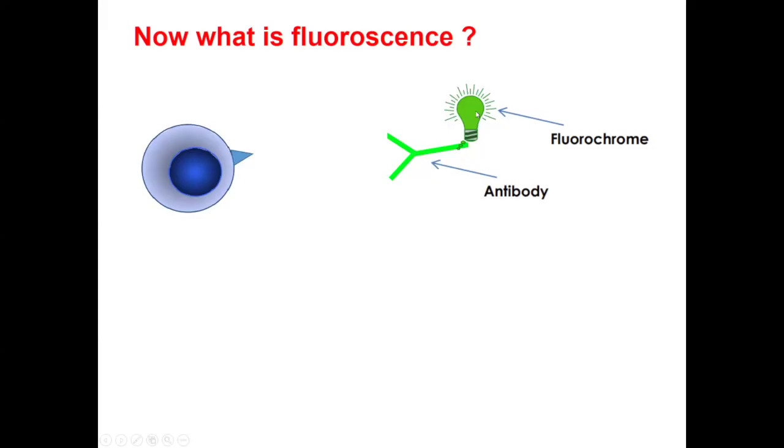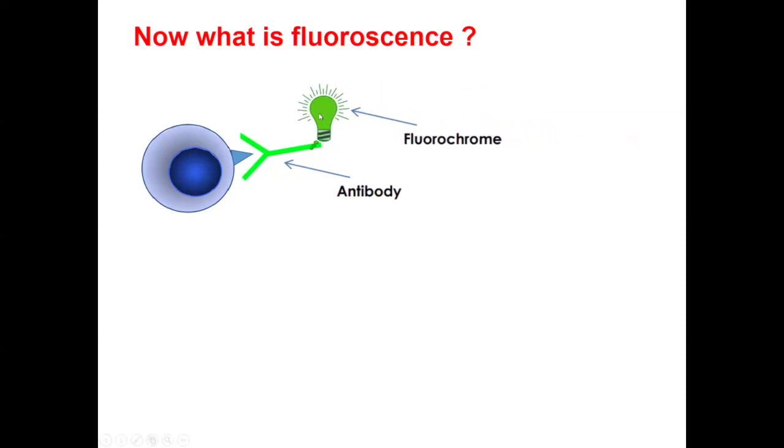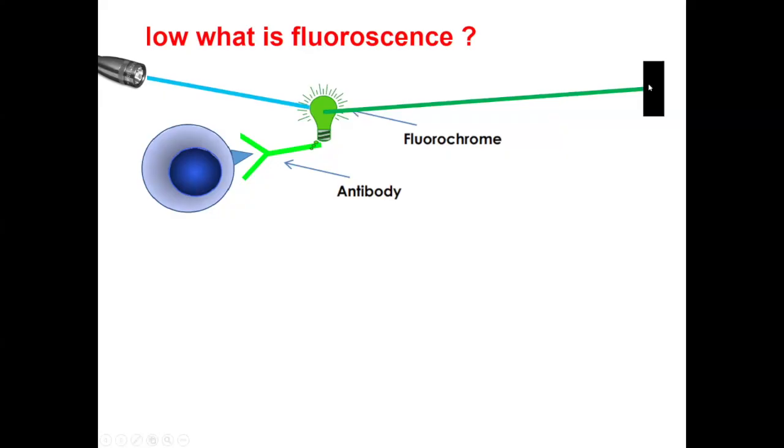Okay, fluorochrome is a tracer element. So when you add it, what happens? This anti-CD20 antibody tagged with fluorochrome will bind only to the B cells and not to T cells. Agreed? Okay. So now this cell, if it goes across the light source, that is the laser, what happens now? This fluorochrome gets excited and it will give signal in a different color, which will be captured by a detector present in the flow cytometer.